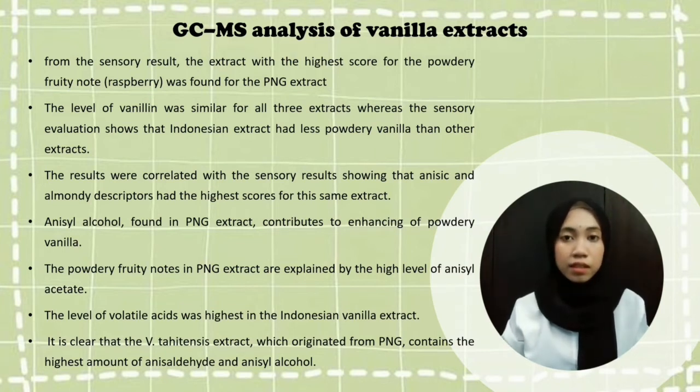However, from the sensory result, the extract with the highest score for the powdery fruit note was the PNG extract, whereas the Madagascan and Indonesian extracts did not display the sensory characteristic. The level of vanillin was similar for all three extracts, whereas the sensory evaluation shows that the Indonesian extract had less powdery vanilla than the other extracts.